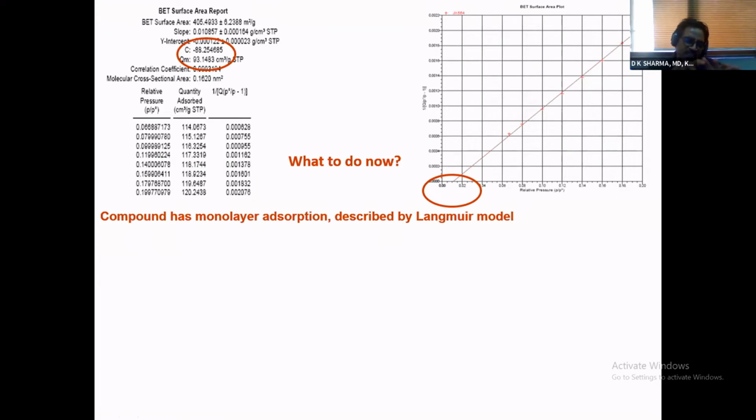I'm not showing that set of six isotherms according to IUPAC. You must remember the first one of which was a Langmuir isotherm. Calling it a Langmuir isotherm, actually in physical adsorption studies, the isotherm that you get for microporous materials is like a pseudo Langmuir isotherm. It's not a perfect Langmuir isotherm. A perfect Langmuir isotherm you get only in chemical reactions, not in physical adsorption.